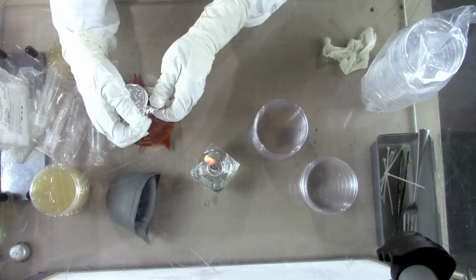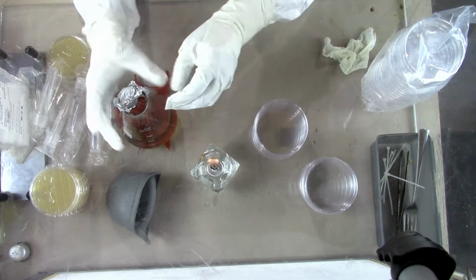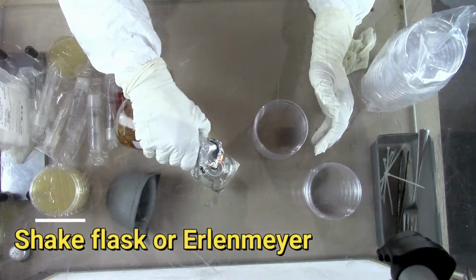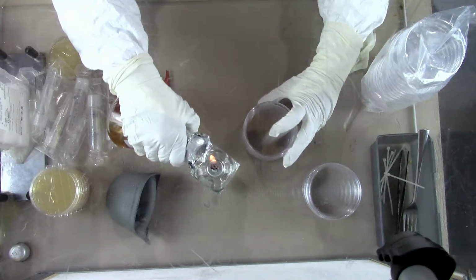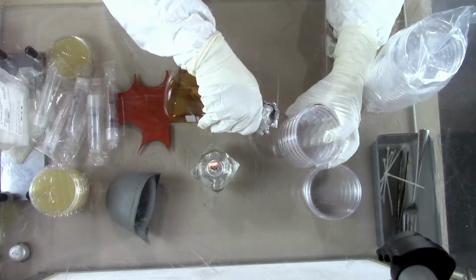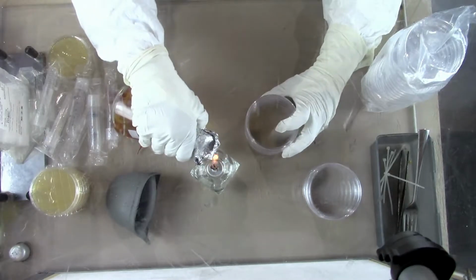So the way that it goes is, as you can see here, I open that media shake flask. In this case, this is hot right now, should be around 45 to 50, 55 degrees. Remember, the agar gets solid around 40 degrees. So you don't want to wait until it's 40 degrees, because then you would have solid agar in your shake flask.